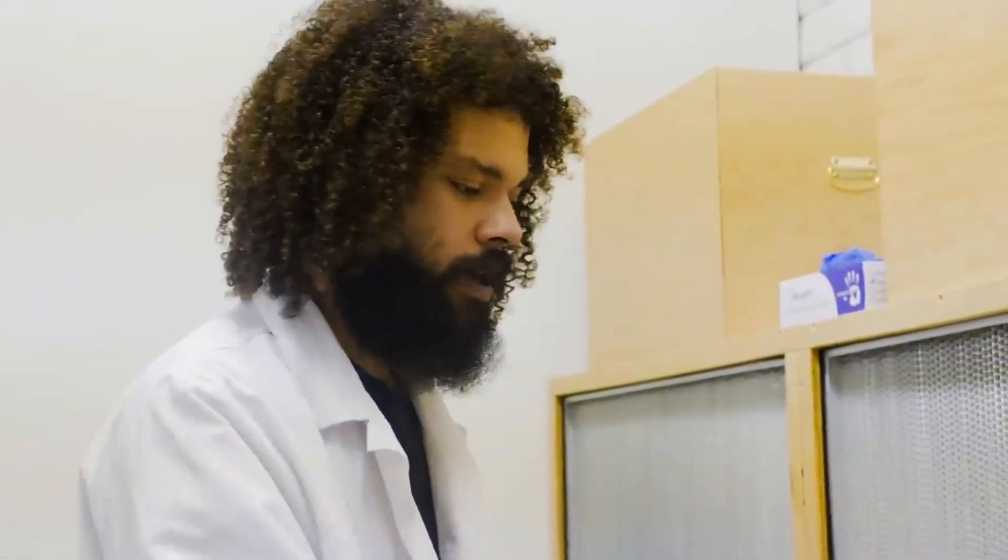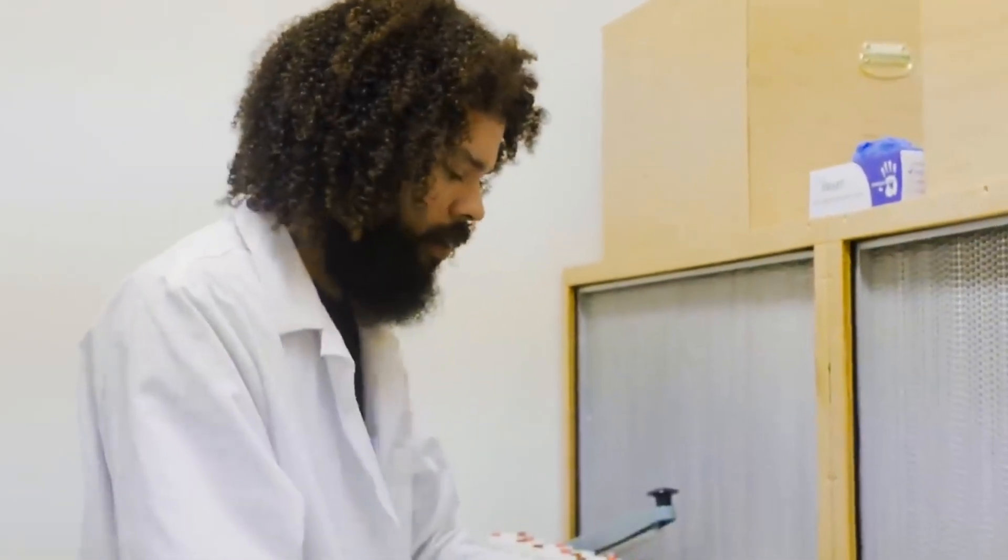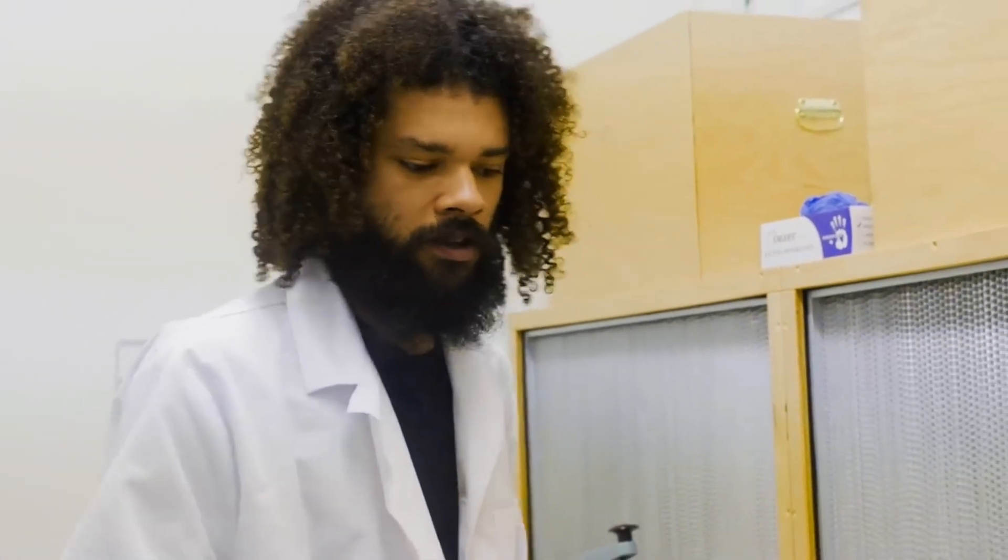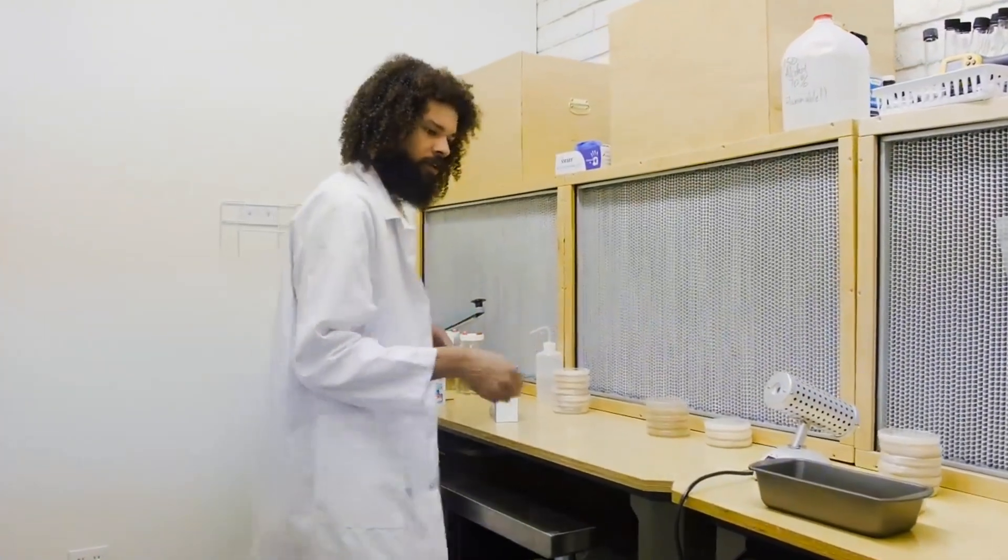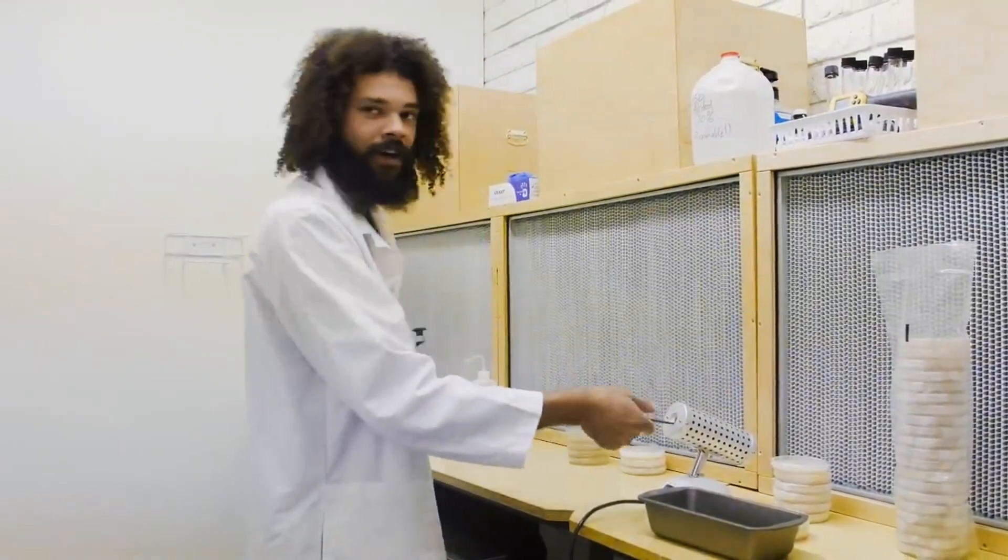You do need a really dedicated sterile space for this kind of work. If you don't have a flow cabinet I'd recommend you either make one or you can find people that make them - you can buy them in smaller sizes as well. Research before you really go crazy with it, or just go crazy and find out through trial and error like I did.